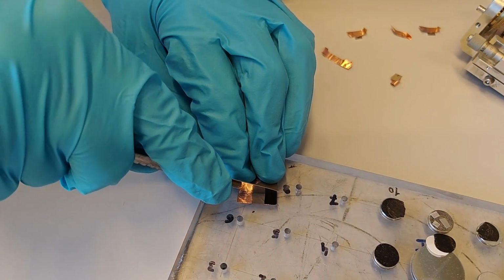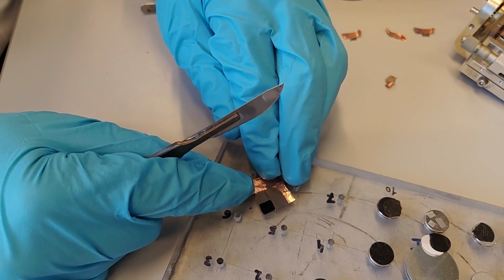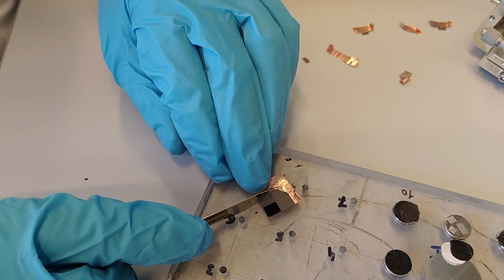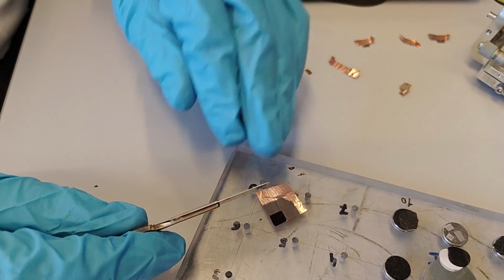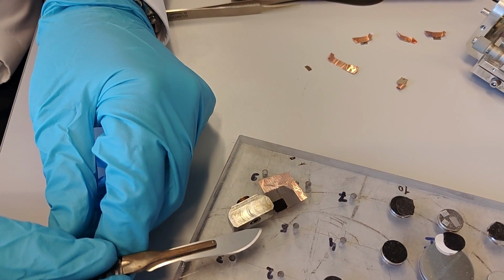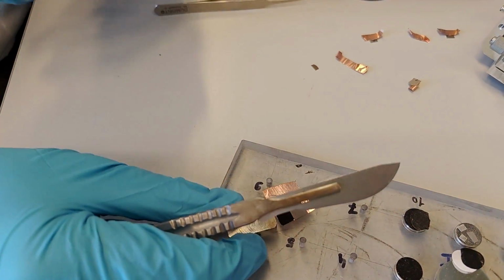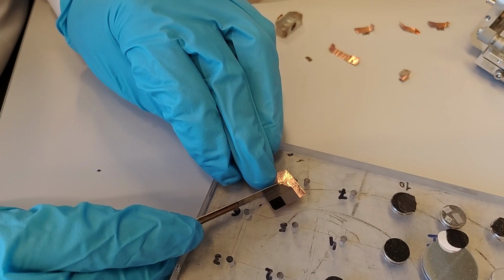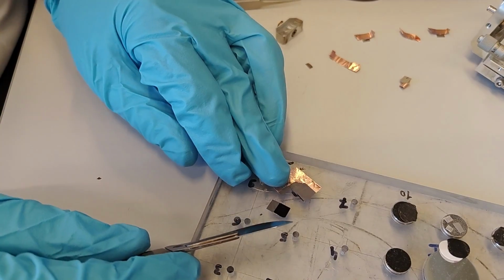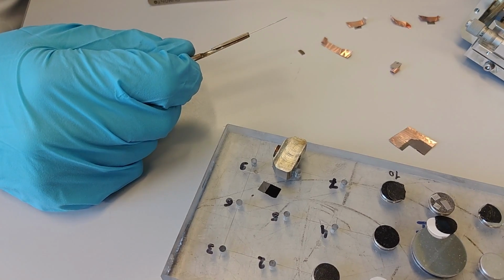Let's see if we can cut out of that, like that. Try to cut it here also. And the height of it should be like, if we put this next to here, we want it sticking out a little bit on the top side, and we want the tape to be in the bottom part here. So that means around 10 millimeter or something like that can be a nice way. So let's try this. That is probably nice. So we take some tape.